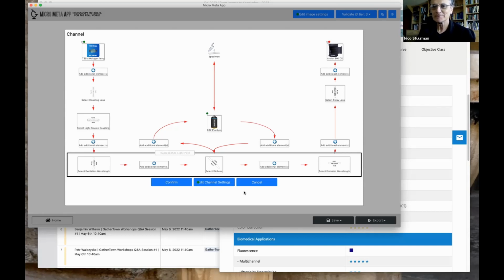It's not going to happen. Yeah, of course, we are going to have to do something. For example, one thing that can be done on that front is, as I said, propagate across a data set. And the other aspect is having templates. So if you do it once, you don't have to do it again. You can reuse the settings file for the next one, and you just change the things that are relevant to change a little bit more.